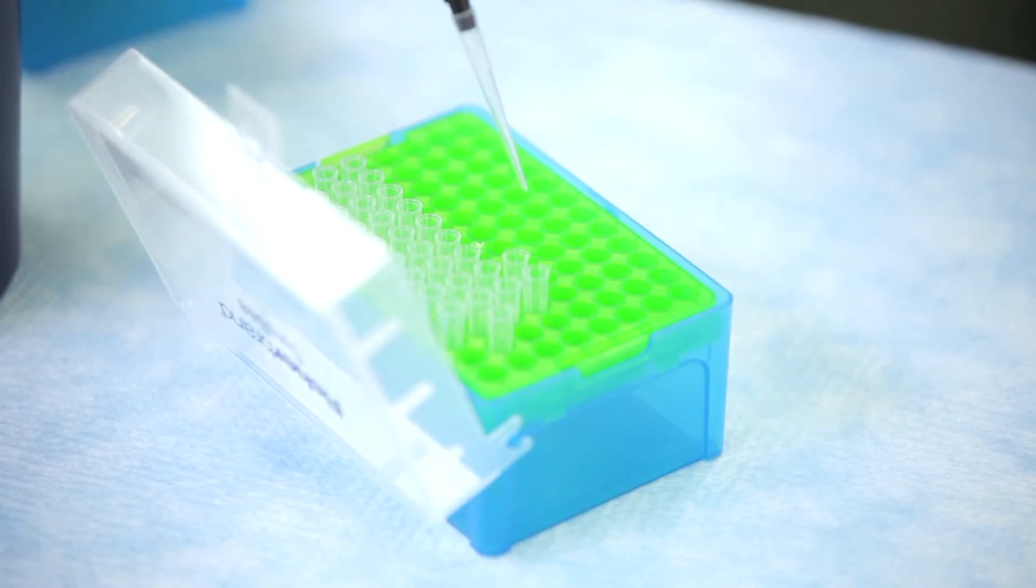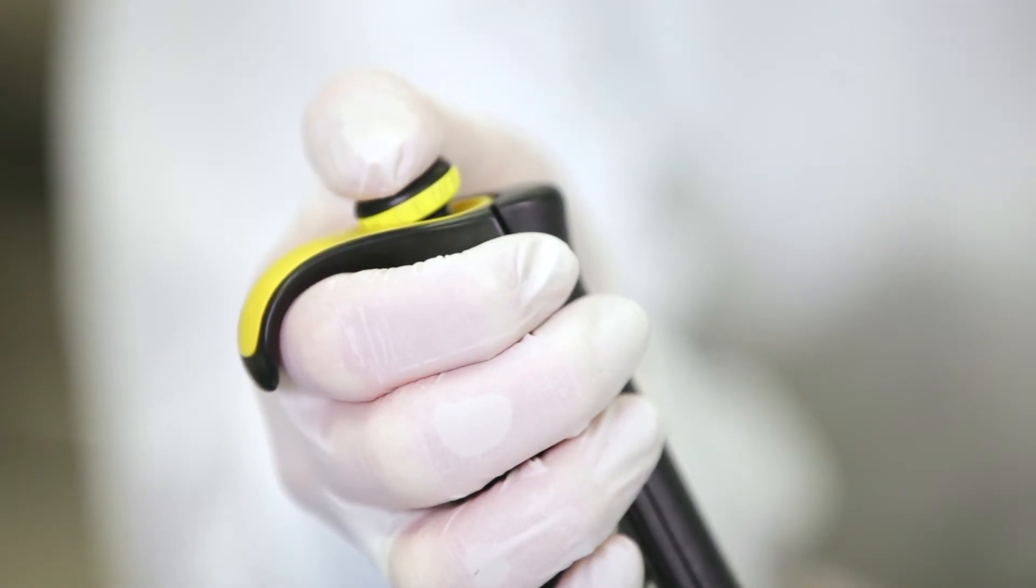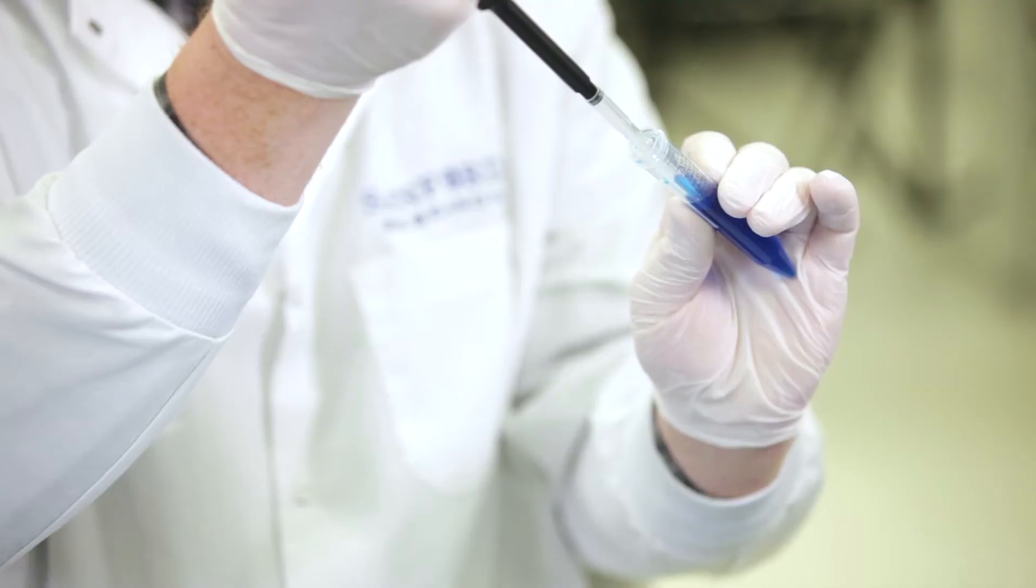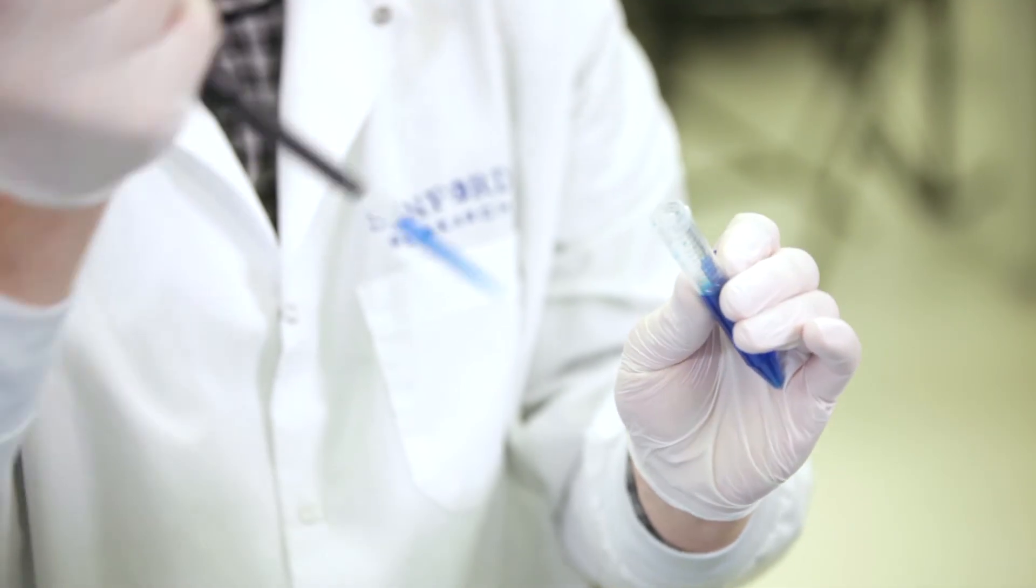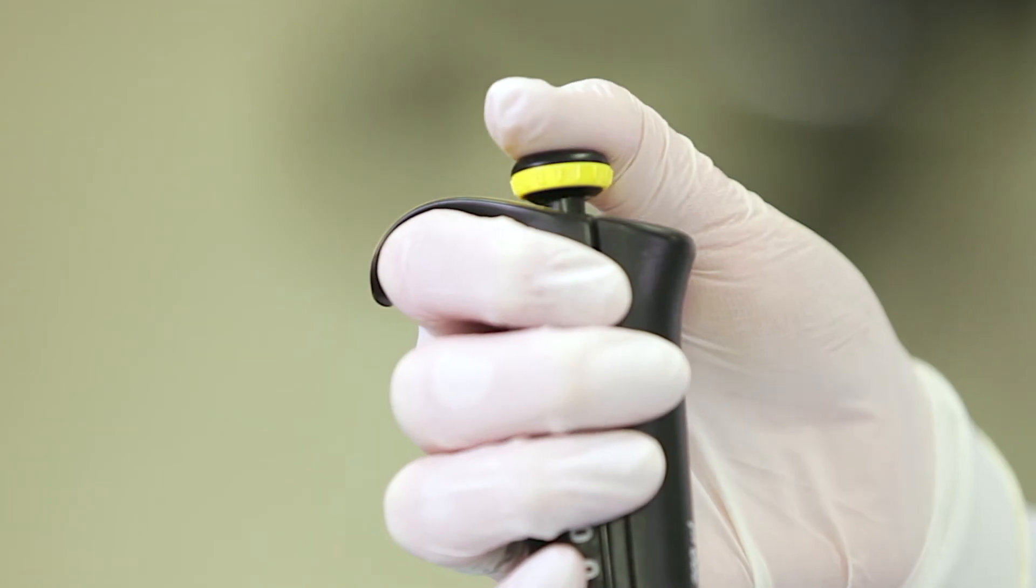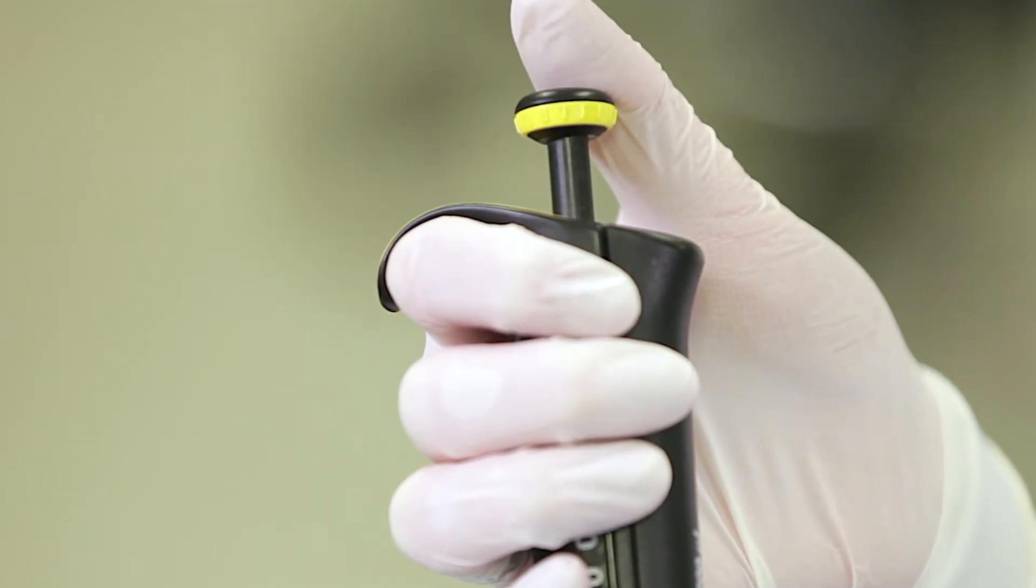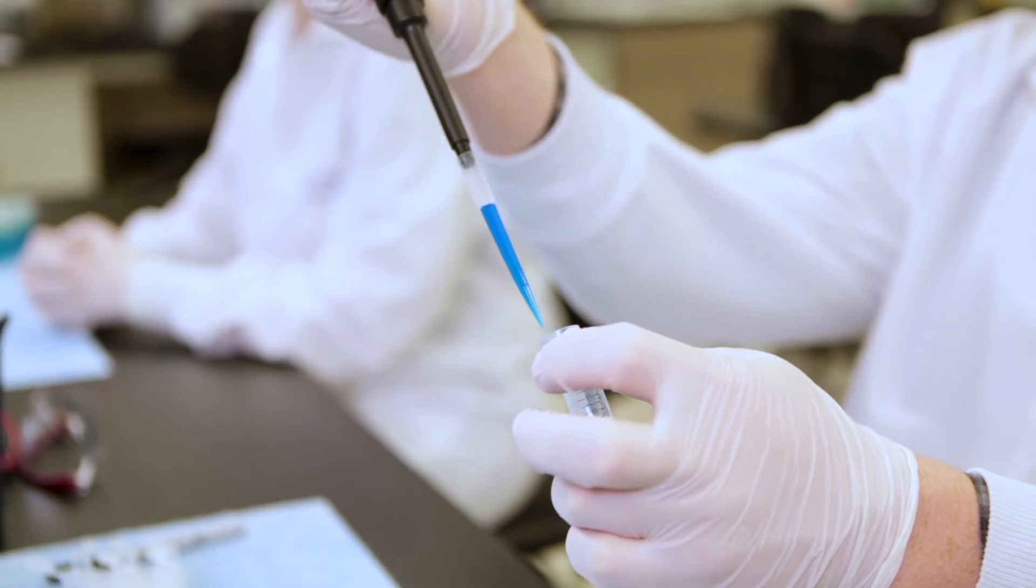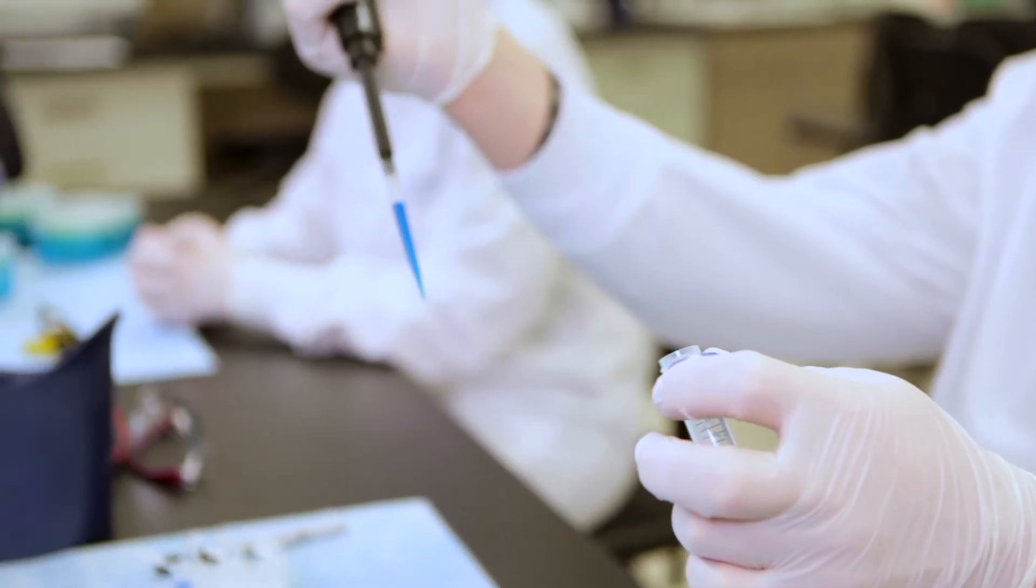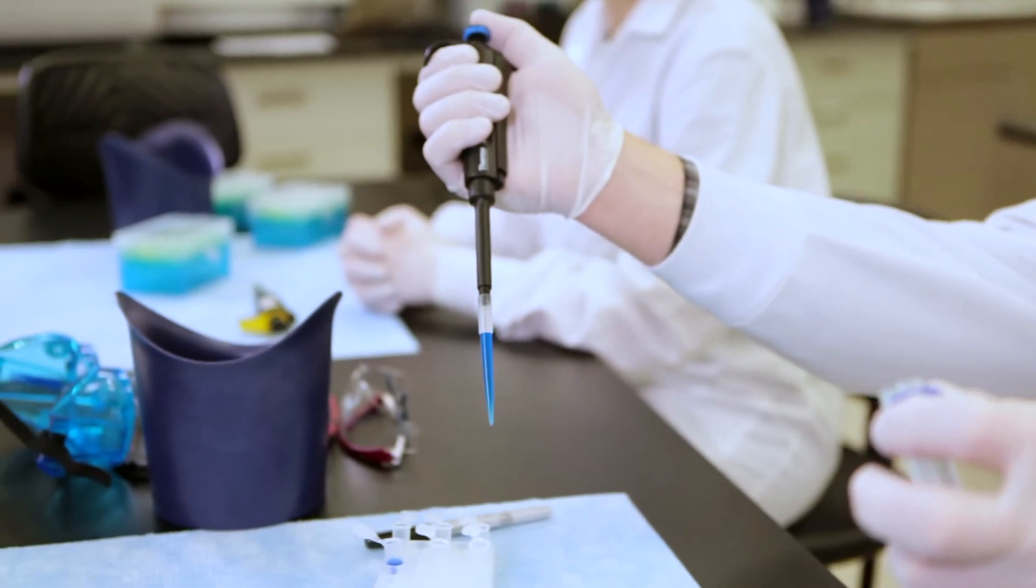To use the pipette, depress the plunger to the first stop. Keep the plunger at this level, submerge the tip just past the level of the liquid you want to draw up. Slowly release the plunger, allowing it to return to its original position. Pause for a second to make sure all of the required volume has been taken into the tip. This is especially important when pipetting more viscous, or thicker, materials.